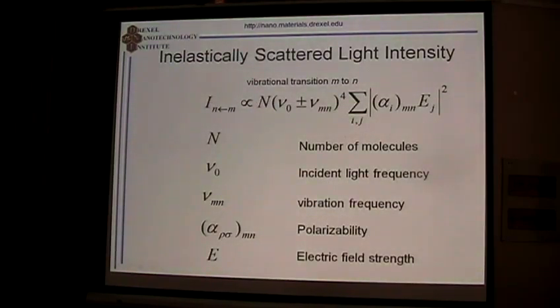Now, I won't overload you with equations. You have seen enough equations in the previous lecture, but this one is important because one of the major problems of Raman spectroscopy is lower intensity. On average, in a Raman effect, 1 photon per million will be inelastically scattered, producing the Raman effect. What does it mean? That intensity is very, very low.